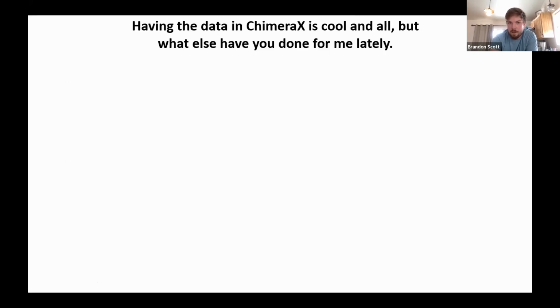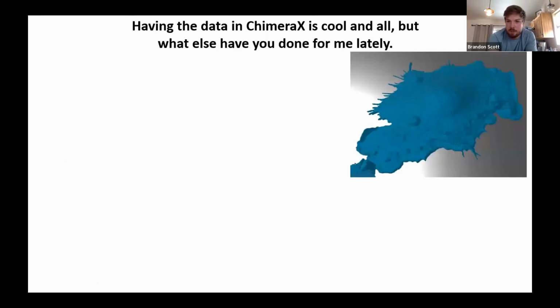Okay. And so for me, that's super cool. But that's not the end, right? What I really want is others to be able to look at this data and interact with it on their own. And so these isosurfaces, the nice thing about that is we can export those as a GLB. So this is a binary GLTF file, which is a standard 3D file format that you can then use in web applications, which is really where I'm interested in taking this.